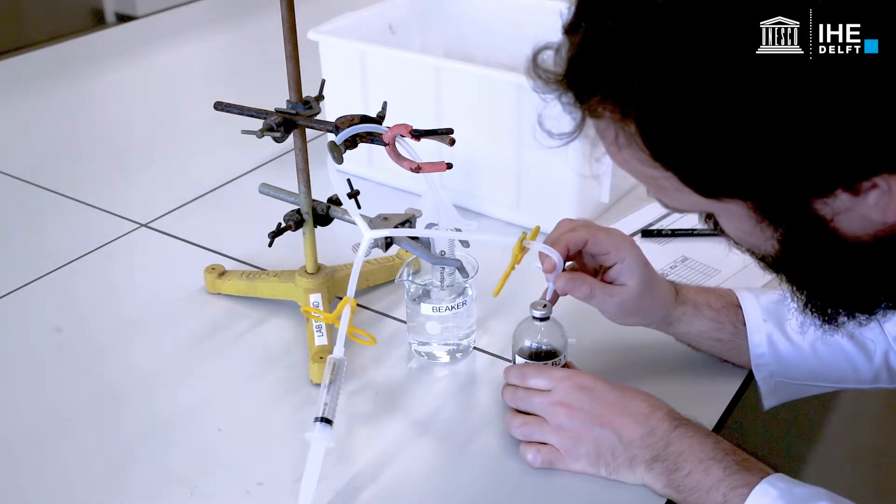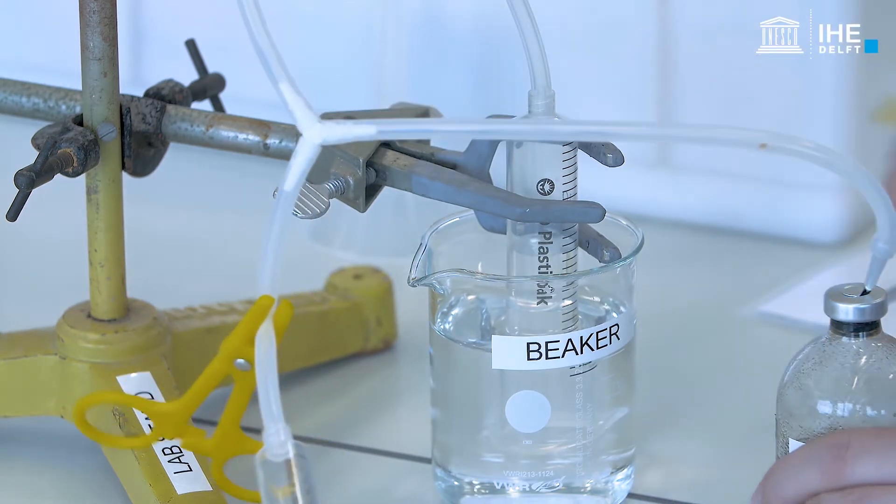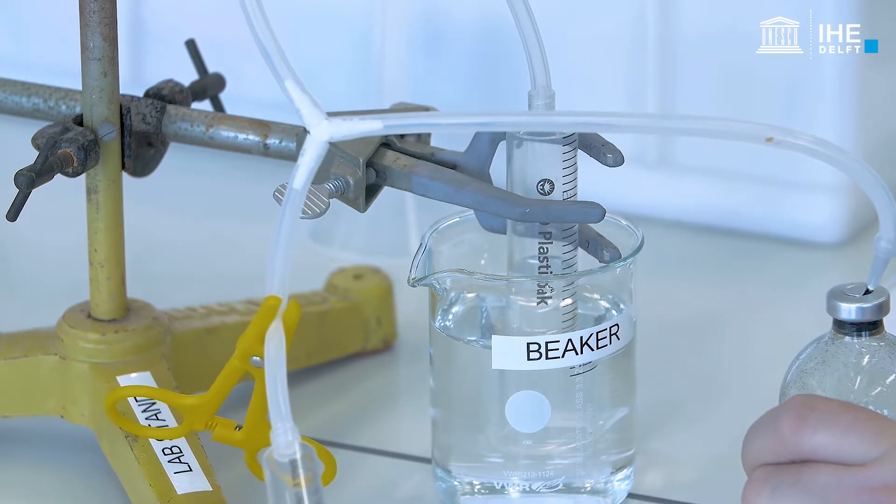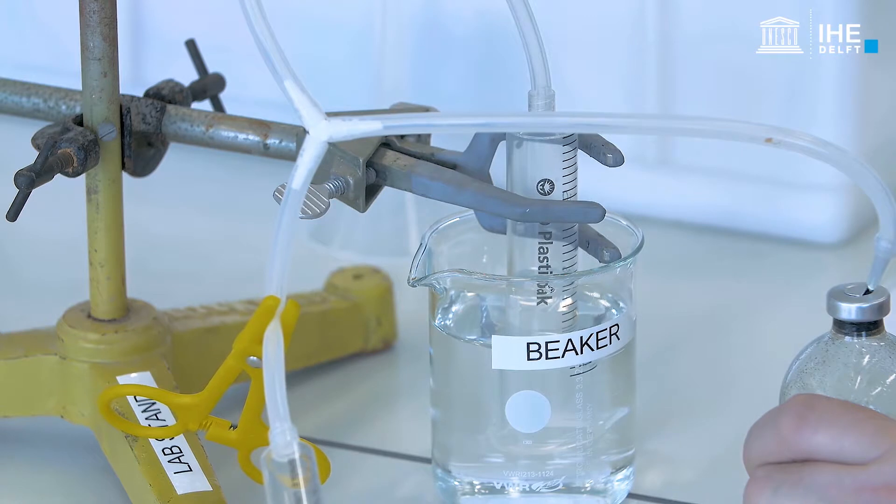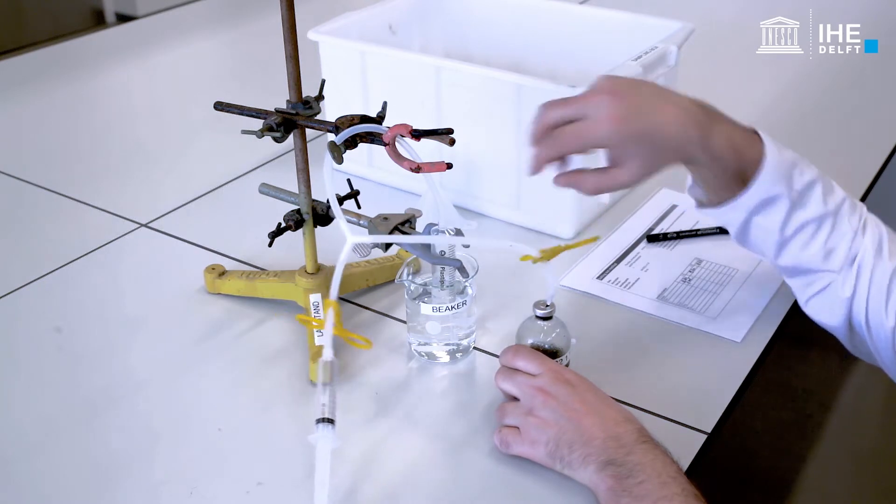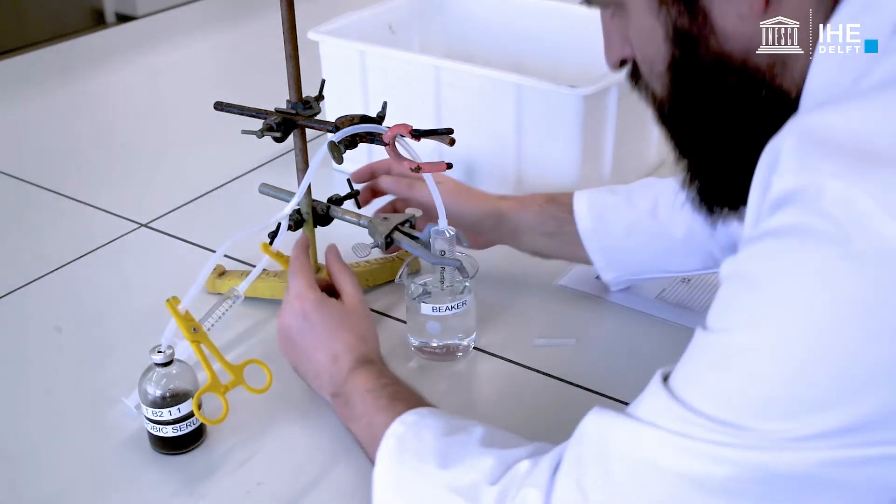Thus, a graduated syringe or burette is submerged in a beaker with water, connected with the tip to a tube with a needle. The initial headspace volume in the syringe is registered as volume zero. Then the rubber stopper of the serum bottle is pierced with the needle and subsequently the headspace volume of the syringe will expand.